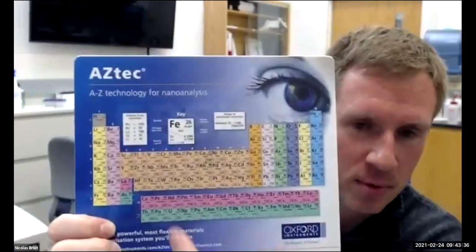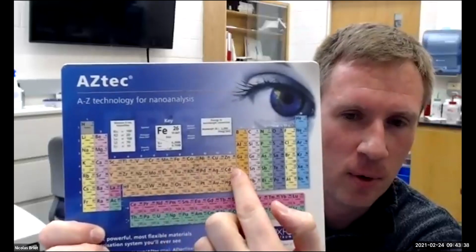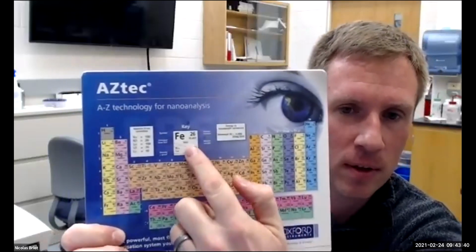So usually you can find in every SEM room tables like this. Sorry, it reversed, but you have all the elements, and it's actually showing you the energy value of the X-rays that are coming out, so you know where it should be. Now, of course, the EDS software will show you that as well, but just know that the X-rays are characteristic. That's how we can identify things.